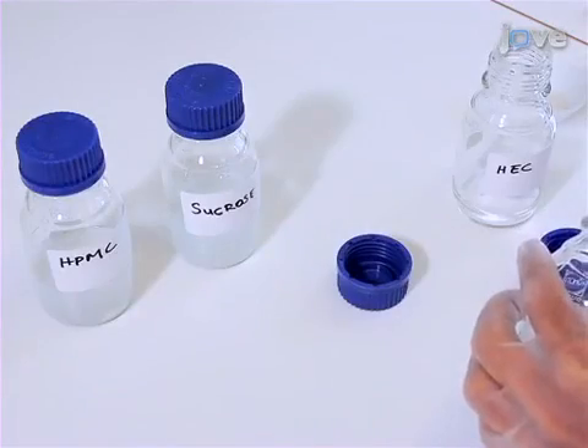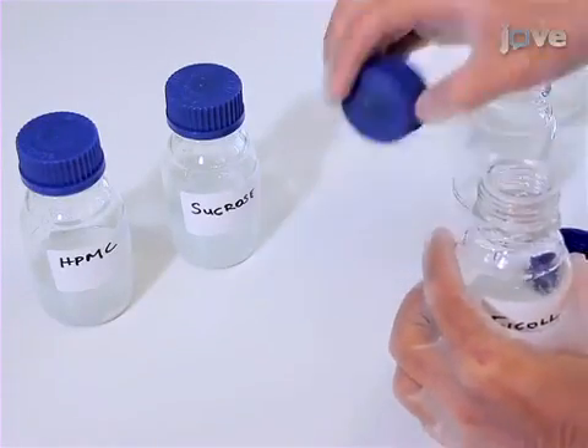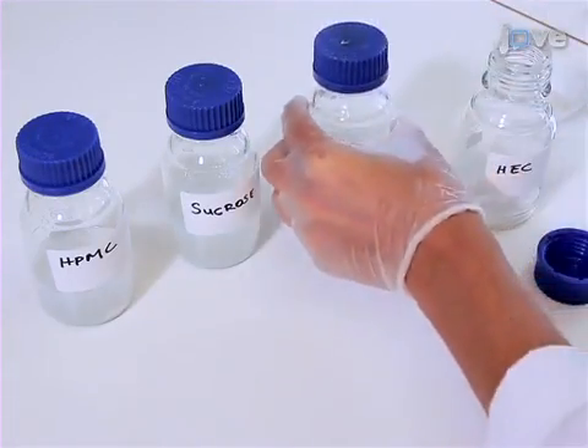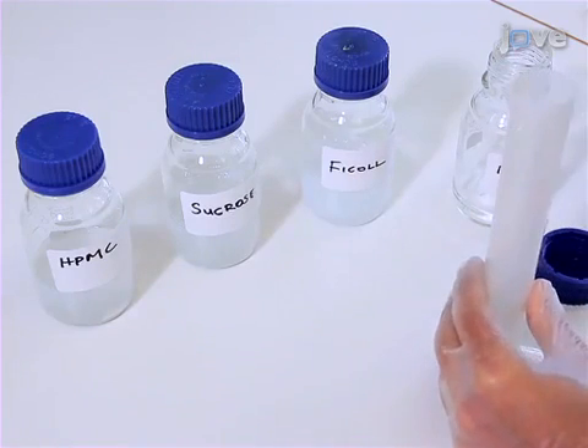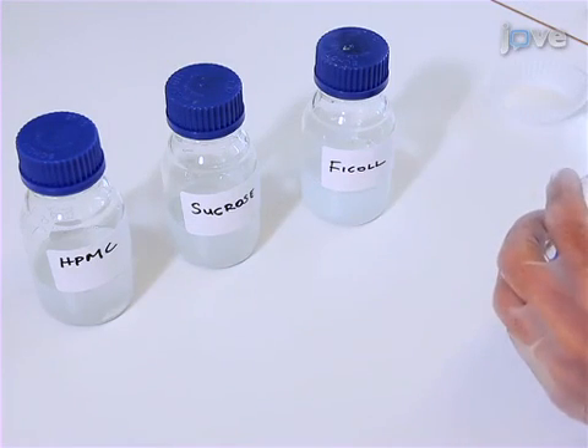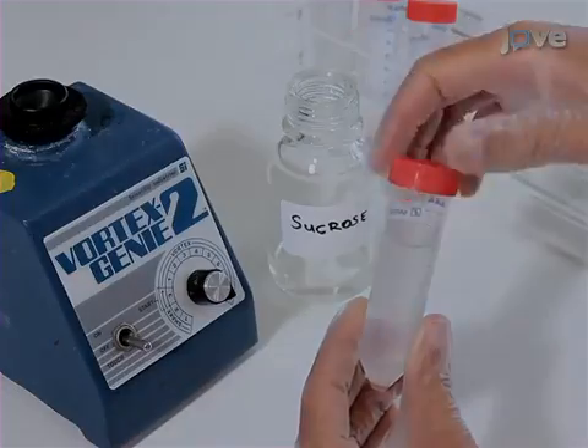To prepare formulation solutions for freeze drying cells, weigh out the respective matrix components and dissolve them in water. To achieve isotonic conditions, adjust the solution with the excipient, sodium chloride, or other cell compatible solutes. To homogeneously re-suspend cells in a low viscosity medium.